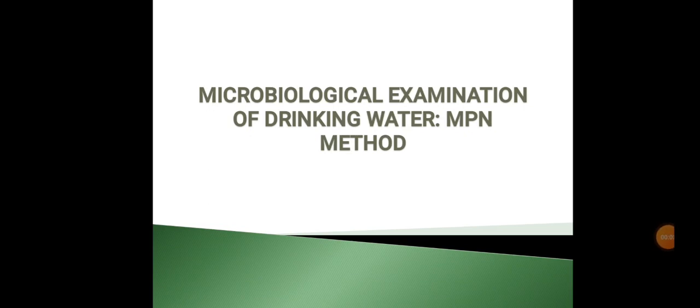In this video lecture, we will discuss the microbial examination of drinking water by the MPN method. What is MPN? MPN is the most probable number, or the count of the organisms present in our food sample, drinking water sample or any sample.